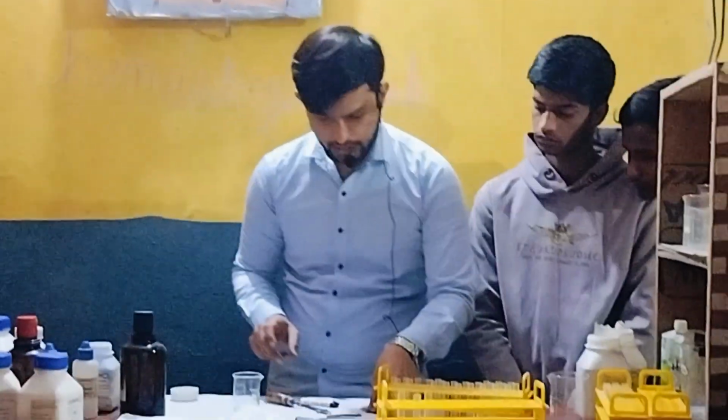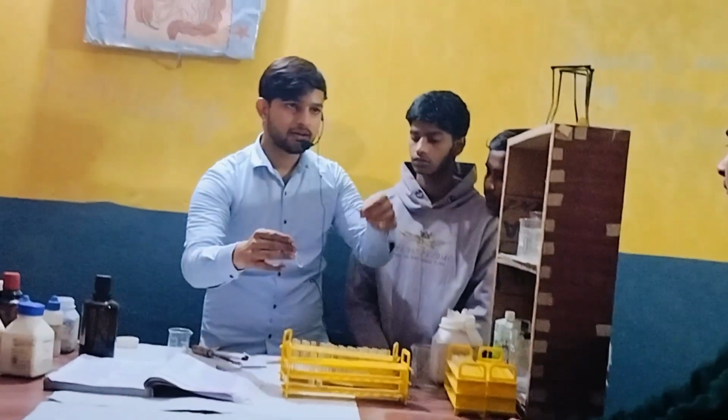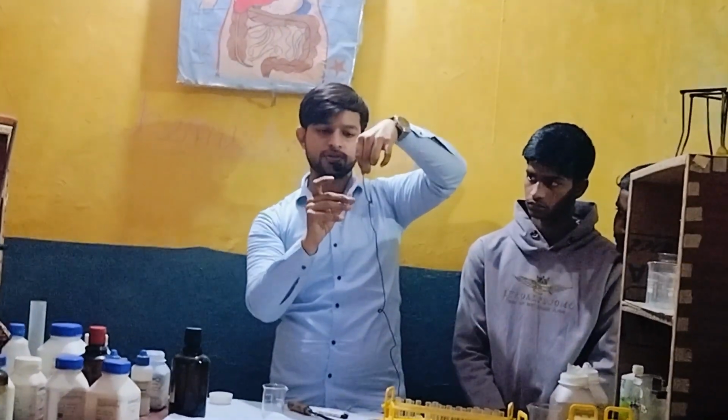Red. This is red in color. Yes. So it's confirmed that in this test tube, what is this? Acid. Okay. Now if I dip this into water, then nothing will happen because water is neutral.